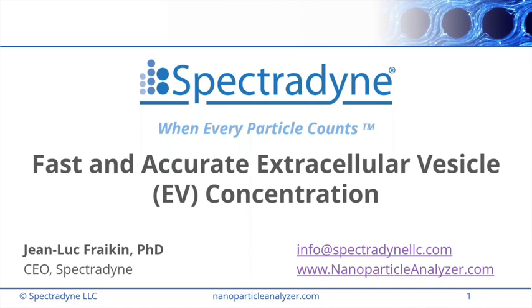So when we're analyzing samples, if we have a sample set, we work out the highest limit of detection across the chip, the area that's the noisiest, to make a defined limit of detection for the whole sample set. And that means that if that was 65 nanometers across all of the chips, or 70 nanometers across all of the chips, we can have a consistent comparison of concentration. And we would say that the concentration detected was at X concentration above 70 nanometers.